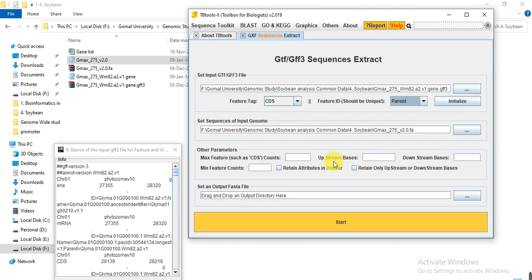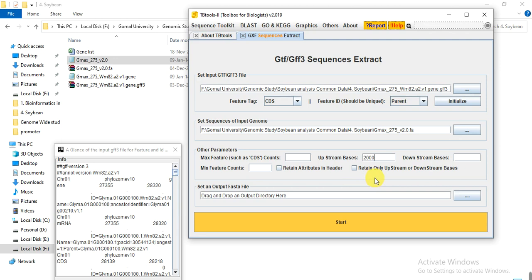In the 'Upstream Bases' box, specify how many upstream bases from your gene's ATG start codon you need. Usually we use 1200, 1500, or 2000. For example, I am writing 2000 — I need 2000 bases upstream from my gene's start codon (ATG). If you need any downstream region, enter it in the downstream box; I did not need it so I left it empty. If you want only the promoter region and not the CDS sequence, tick the box 'Retain only upstream or downstream bases'.